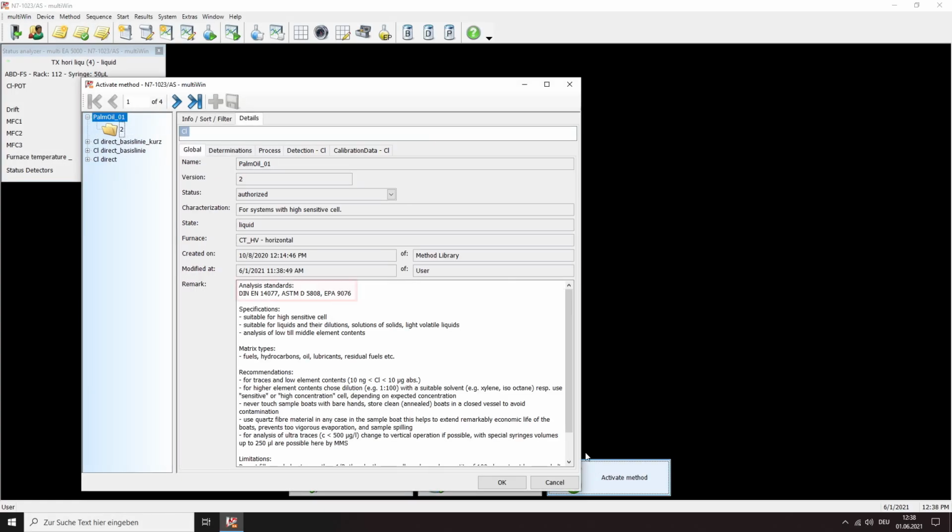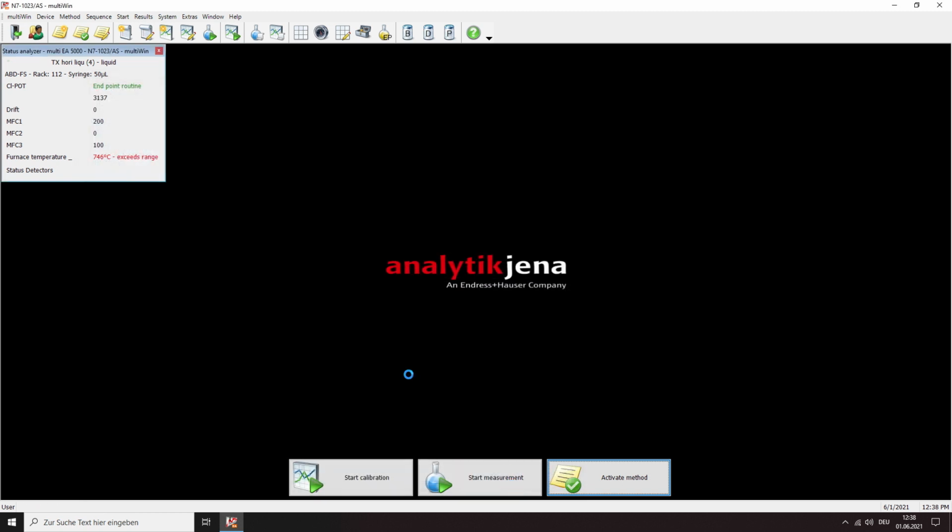In the food, oil and gas and petrochemical industry, compliance with product specs and analytical regulations is crucial. This means sample supply, analysis process, calibration and sample pretreatment have to meet these requirements.